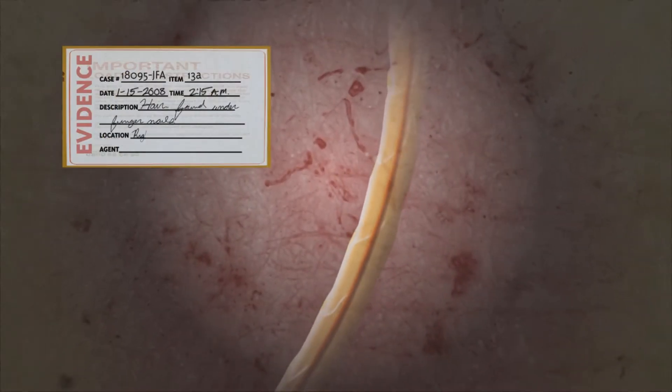The first step is to extract a small amount of DNA from a sample taken from an individual or piece of evidence.